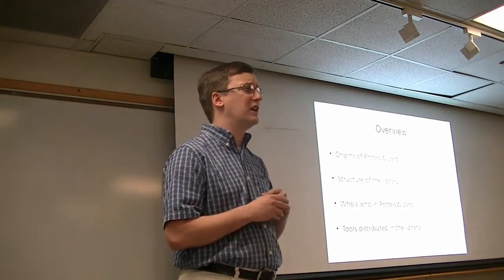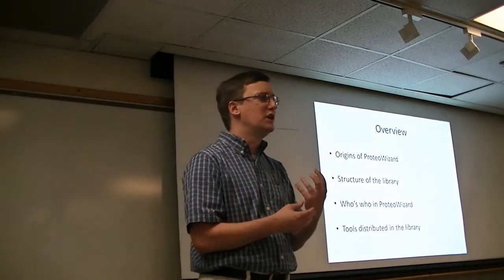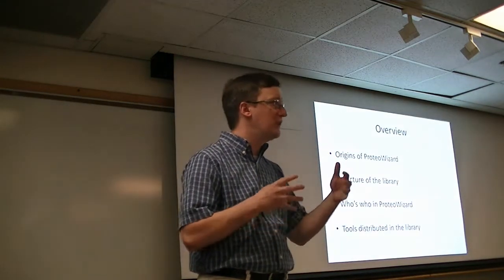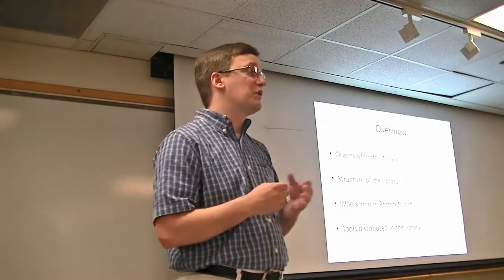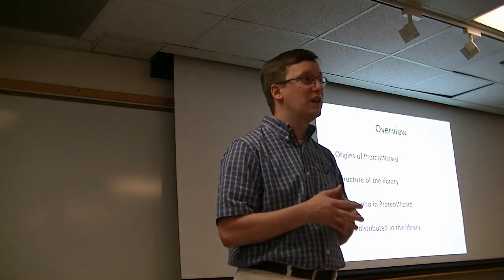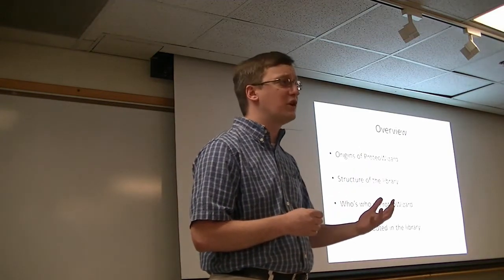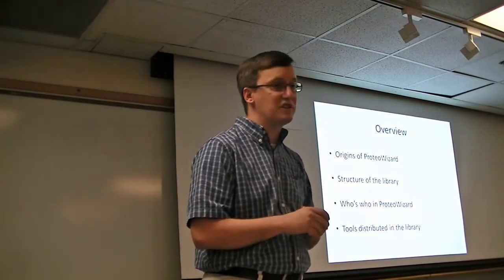And from there, start talking in more detail about the origins of the library, the structure of what's feasible within it. How is a tool built on ProteoWizard different than a tool included within ProteoWizard, for example? And it's of course worthwhile to talk about who's made these different contributions to ProteoWizard along the way. So we'll spend some time talking about each of them. And from there, we'll also talk about a set of tools that have been built on ProteoWizard or that are included within it that are accessible to anyone who downloads the toolkit.